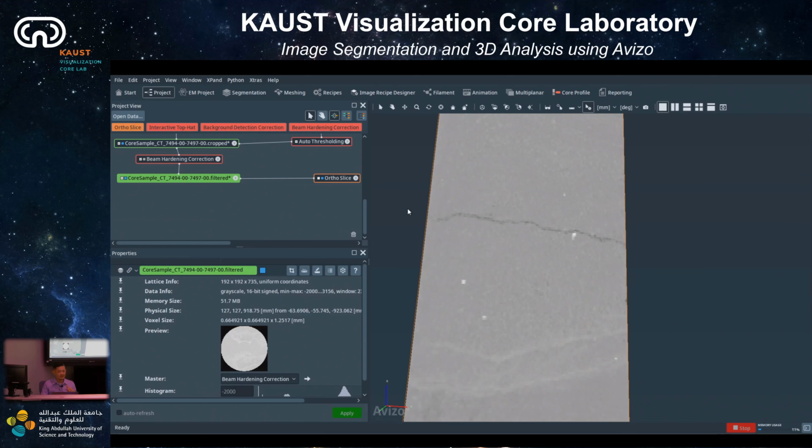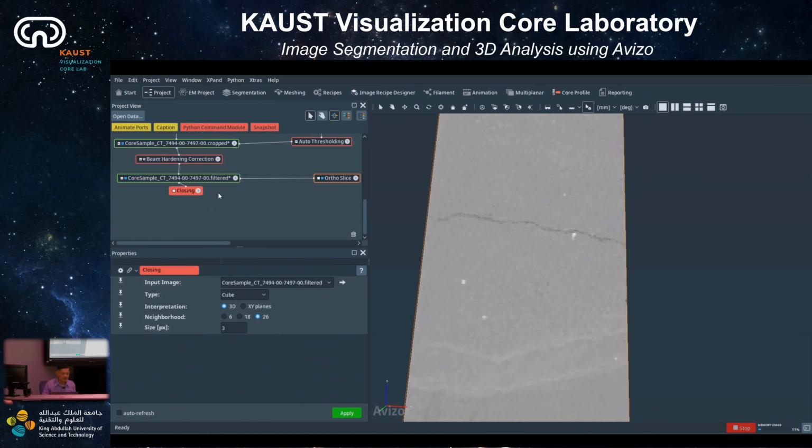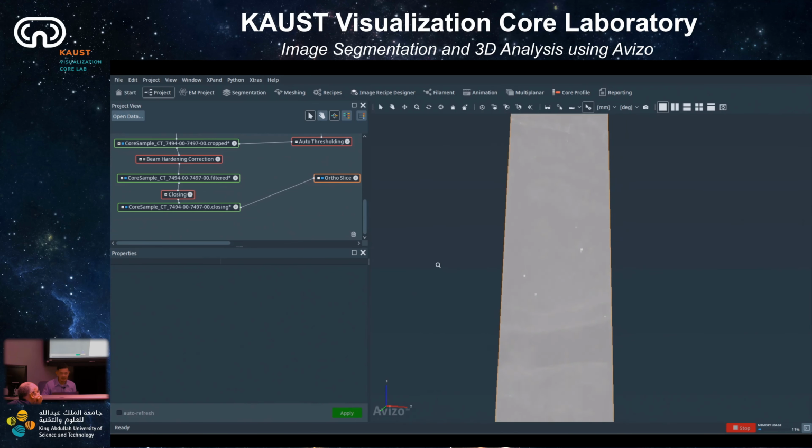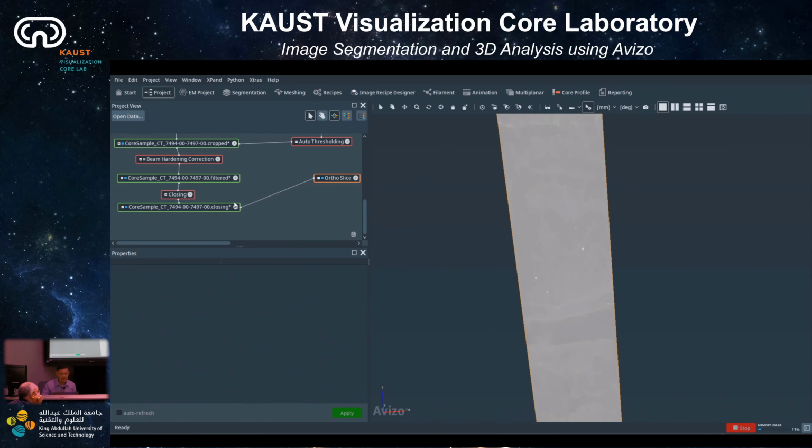Now, first thing to explain top hat. First thing you do is closing. So right click and select closing. Only closing. You see this module. What we're going to do is close this image. So click OK, apply, and you look at the closed image like this. Here, before and after closing, you can see they do the grayscale closing operation.